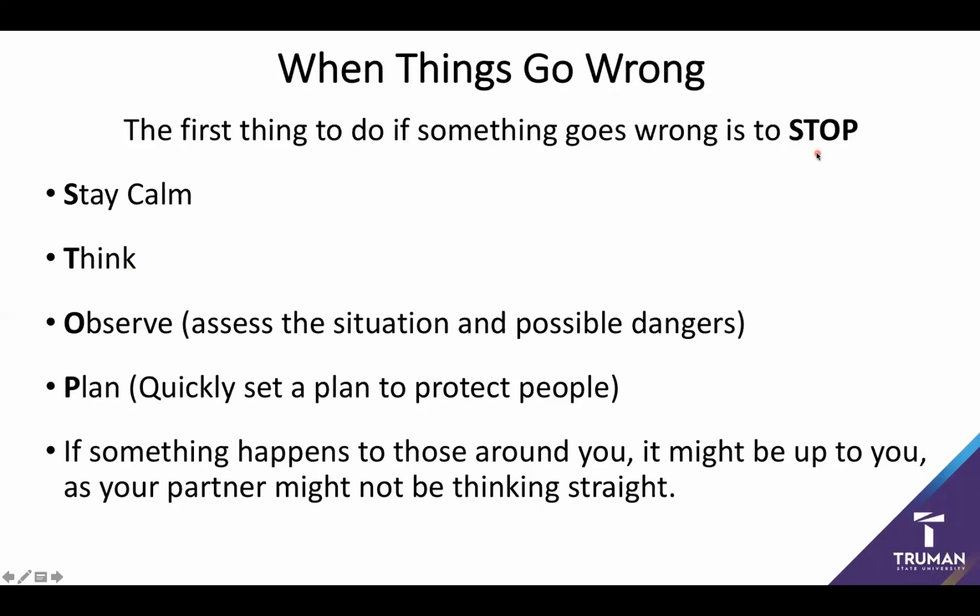So again, if something happens, make sure that you stop. And if something happens to those around you, make sure that you are willing to step in to help out, because they might not be thinking straight and it might be up to you to rescue the day.